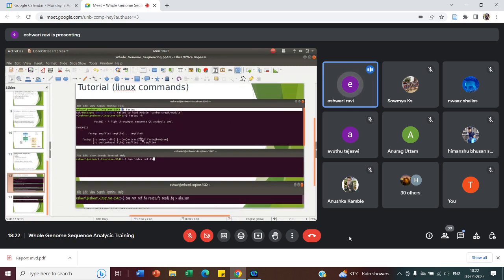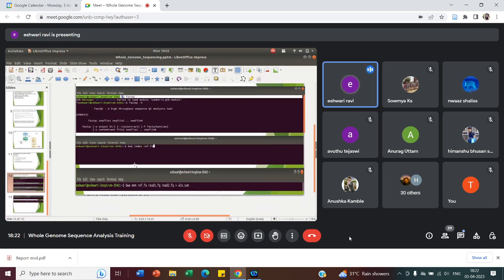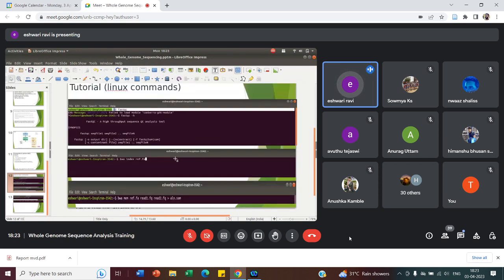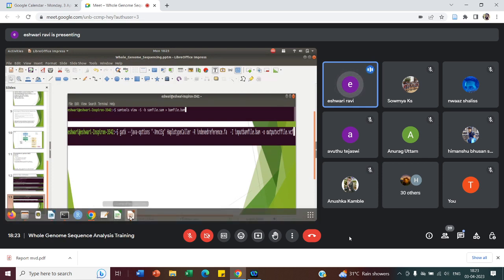As an example I've given here is FastQC. We can execute FastQC by typing 'fastqc'; the minus H flag gives you a help listing all commands that can be used. Then BWA indexing — I shall explain in detail tomorrow; this is just a reference tutorial. SAM tools are used for SAM file and BAM file conversions and visualizations. GATK is one of the variant calling tools we will use.